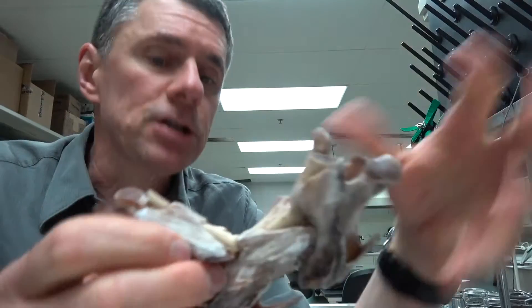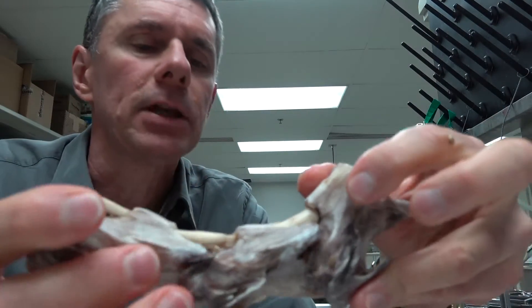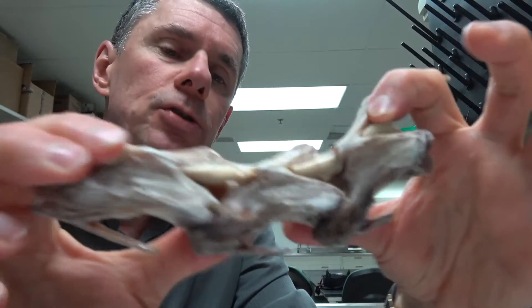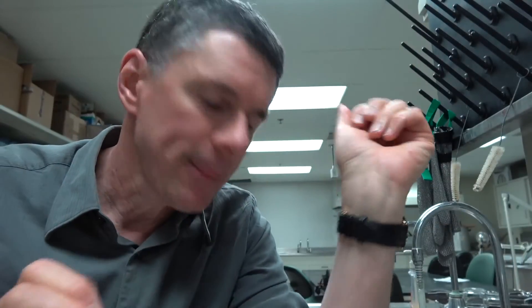So I'm about to finish this preparation, meaning I'm going to take this ligament out so that we can have nothing but the dried vertebrae. But before I did that, I thought I would just show you the dorsal elastic ligament of this ostrich. That's all for today. Thanks.